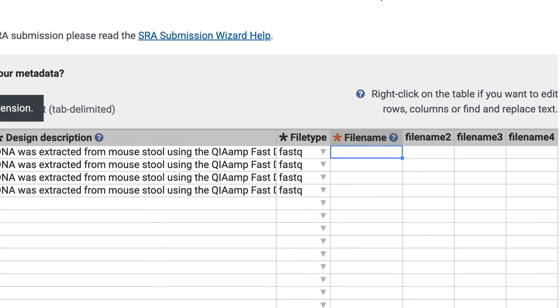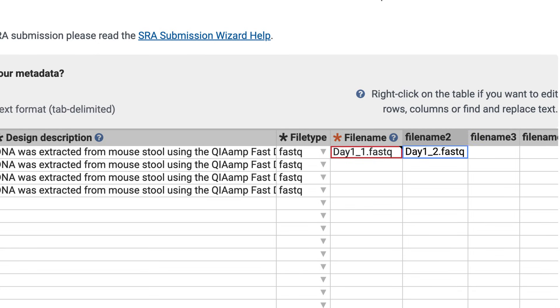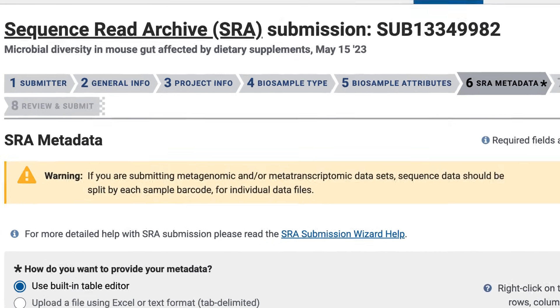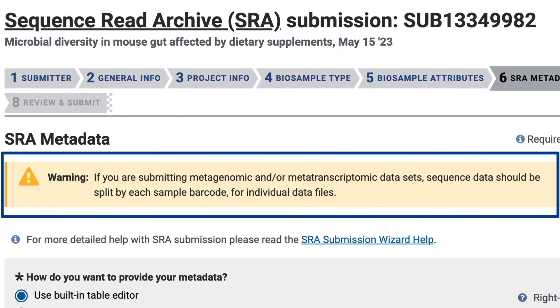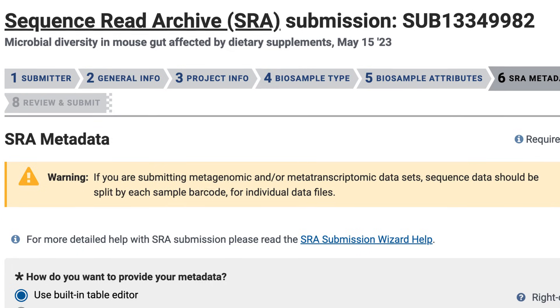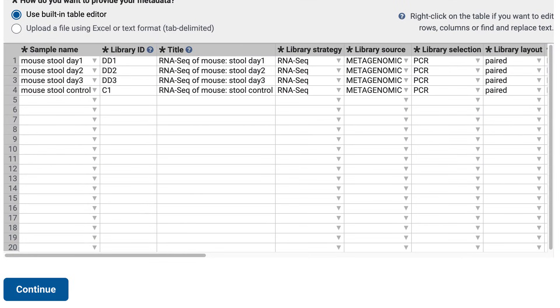Now it's time to enter my file names for both the forward and reverse sequence files from each of my four samples. In my case, day1_1 is one strand and _2 is the other strand. When you click Continue, you will see the warning: if you are submitting metagenomic and/or metatranscriptomic datasets, sequence data should be split by each sample barcode for individual data files. My files are demultiplexed by sample, so I'll click Continue again to proceed. Otherwise, I could make updates here in SRA metadata.